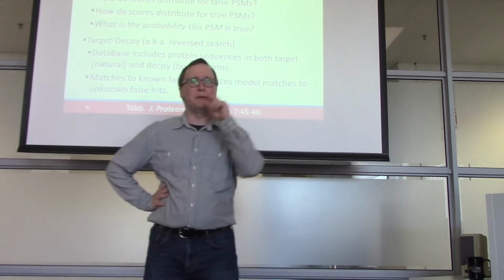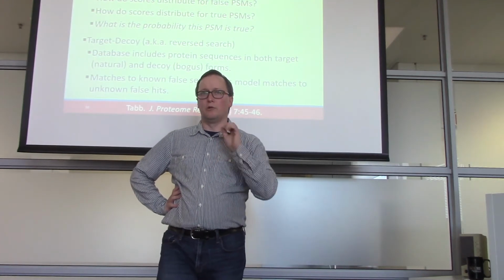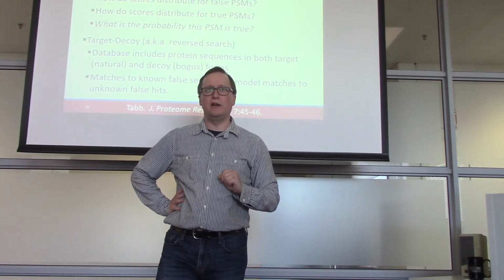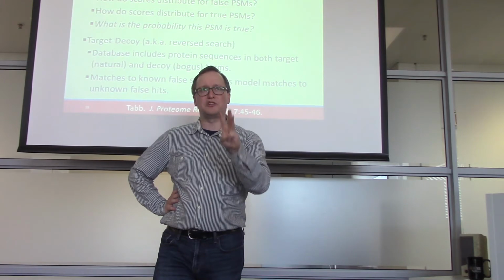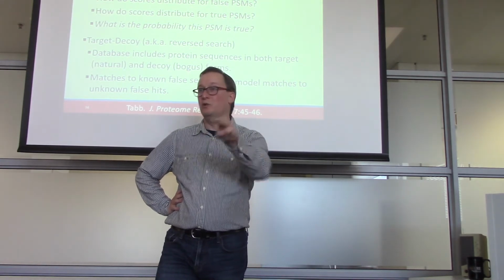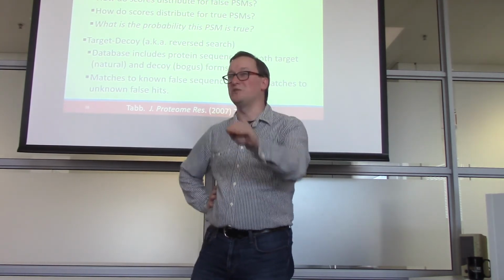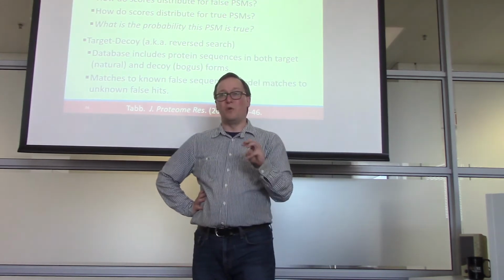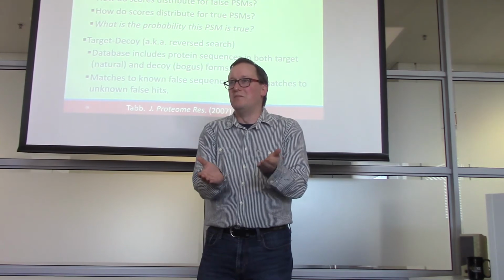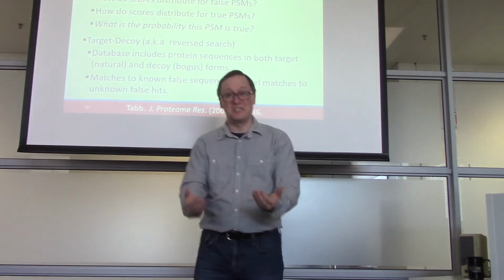Let me give an obvious example for this. Maybe before you join a lab for a master's degree, your principal investigator has run a proteomics experiment. They now have 3 spectra that match to a protein that got them very, very excited. And they want your 2 years as a master's student to be invested in figuring out what this protein does. Do you want to have the next 2 years of your life built around whether this protein is real or not? This is difficult, right?